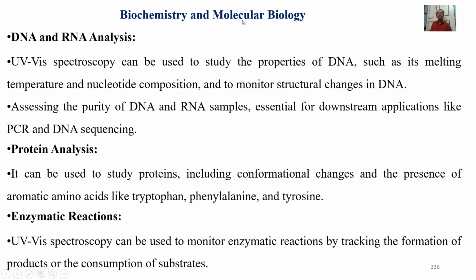Biochemistry and molecular biology, DNA and RNA analysis. UV spectroscopy can be used to study the properties of DNA, such as its melting temperature and nucleotide composition, and to monitor structural changes in DNA. Assessing the purity of DNA and RNA samples is essential for downstream applications like PCR and DNA sequencing.